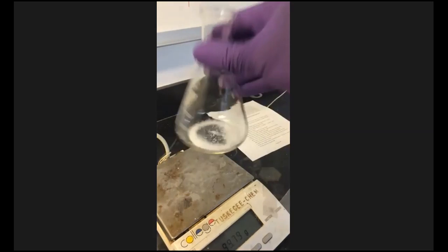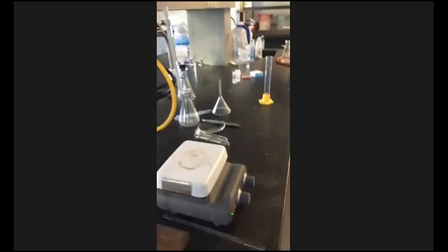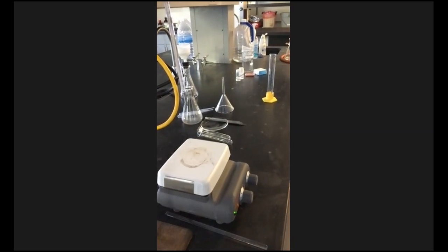All right, so now we have our salt mixture. We have it in an Erlenmeyer flask. We're going to come back over here where the hot plate is, and then we're going to go to the next step in the procedure, which is, we added a gram. We're going to figure out the percentage later on.